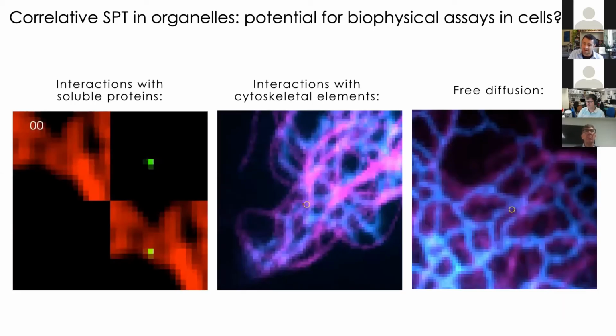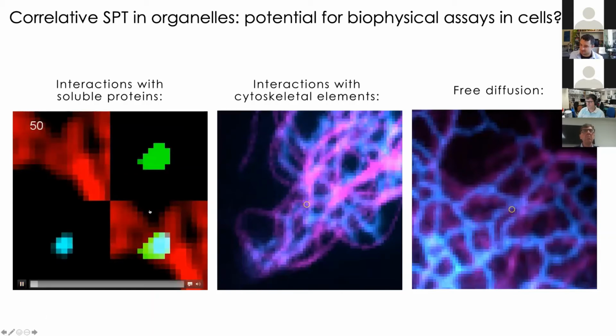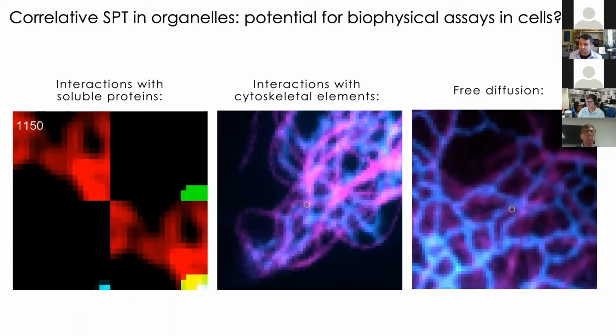I'd also like to end with a shameless plug for this type of correlative single particle tracking approach, because even though I've shown you today about interactions with an organelle, you can see lots of other kinds of behavior with this tool. We've worked with a really talented grad student, Tim Obel at the MDC, to work out 2-color tracking in the system. Here, these are 2 proteins that are directly bound to one another, and we know they're interacting or part of the same complex because they move in perfect correlated motion over an extended period of time.